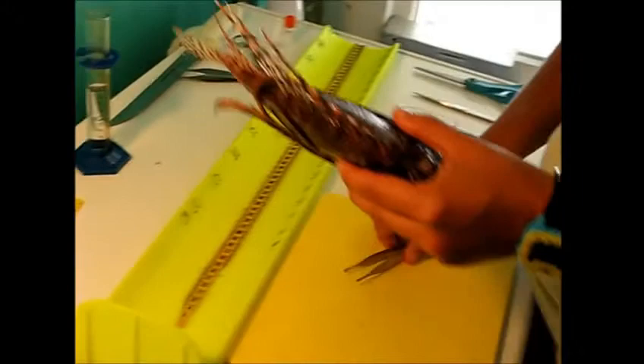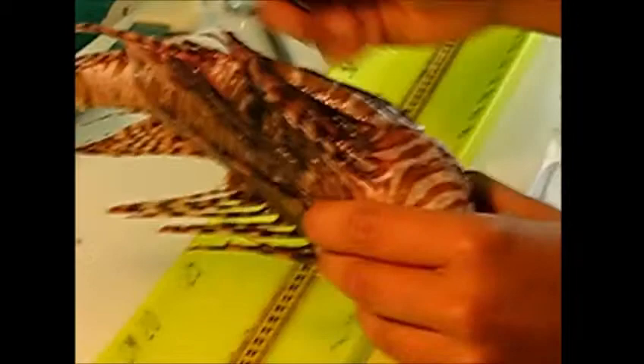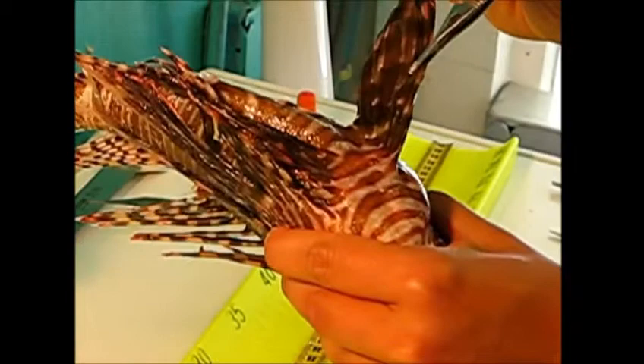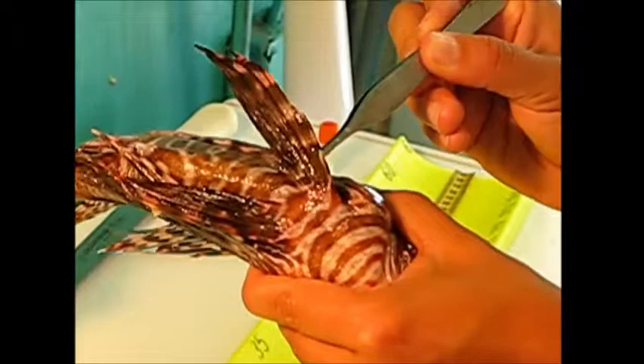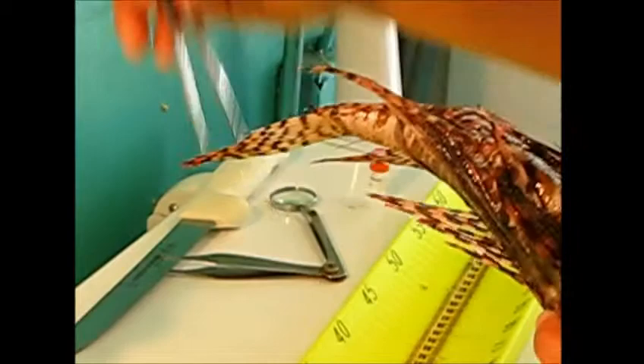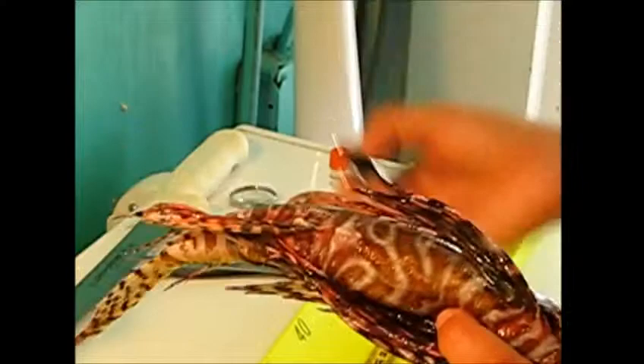On the dorsal side of the fish we have 13 spines — you can see them all right here, they're very very sharp. If you turn the fish to the belly, they have two pelvic fins, and there is one spine at the leading edge of each pelvic fin. Also on the belly of the fish you have the anal fin, and there are three very short spines at the leading edge of the anal fin. That makes 18 total venomous spines.